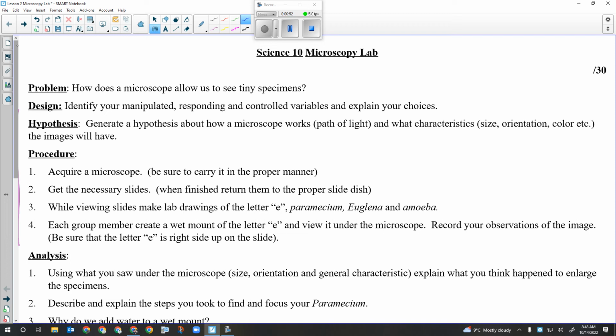And then, obviously, as we're looking at all the specimens, we're going to try not to change microscopes right in the middle of the experiment, or change our lighting significantly, or basically anything that could affect how images look through the microscope would probably need to be controlled.